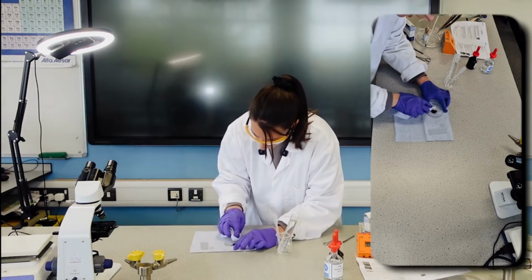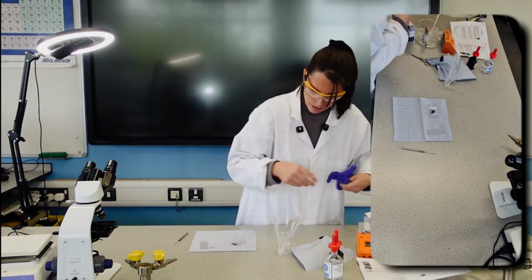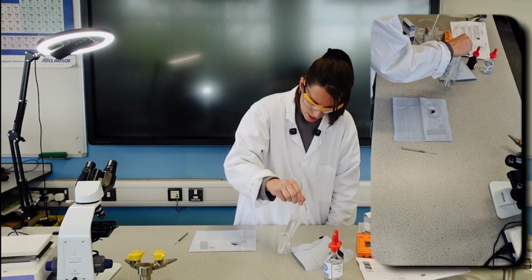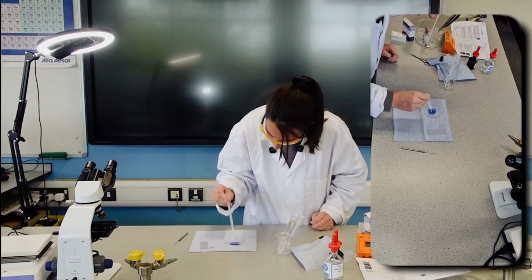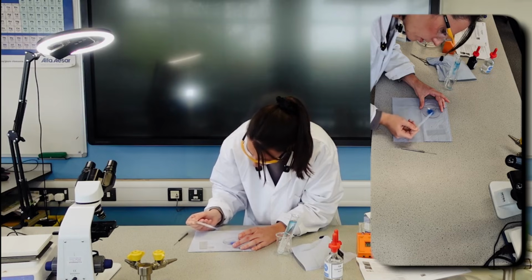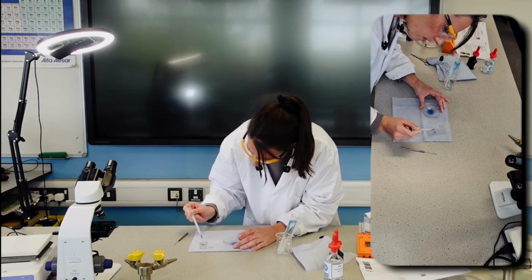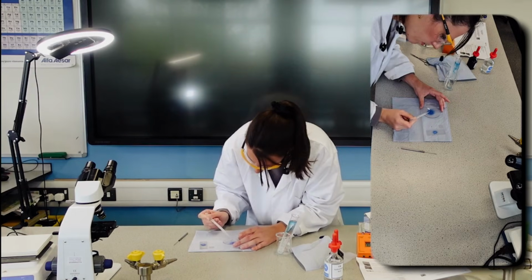I'm just going to remove some of the excess stain. Let's take these gloves off. Rinse it with some water just so I can see. Right, I'm going to try and deliberately now just suck up my root tips and place them onto my slide. So there's some of it there.